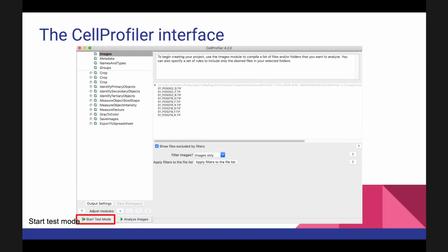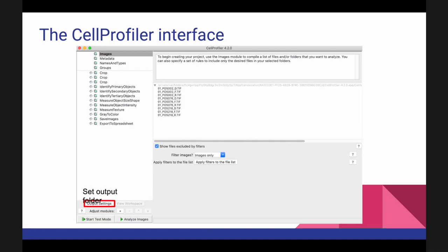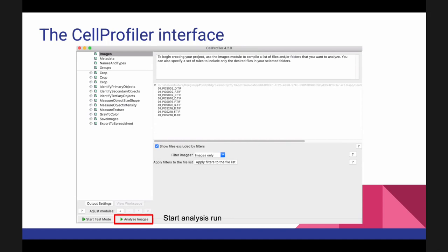There are two ways to interact with the program. Most people spend their face time with CellProfiler in Test Mode, where you go through images one at a time and see how tweaking a setting changes the output. Once you're satisfied, you click Output Settings to specify where your output goes, then hit Analyze. CellProfiler will natively multi-thread and run however many images you have — we've used it for experiments with three images and experiments with three million.